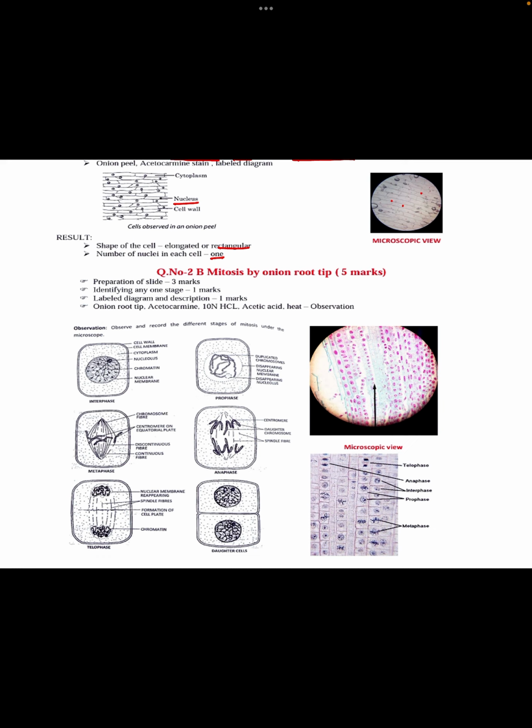This is all for the 1A. Out of 4 practicals you will be getting any 1. Okay. Now the question number 2. So this is mitosis, and it is a compulsory experimental question where you have to perform.